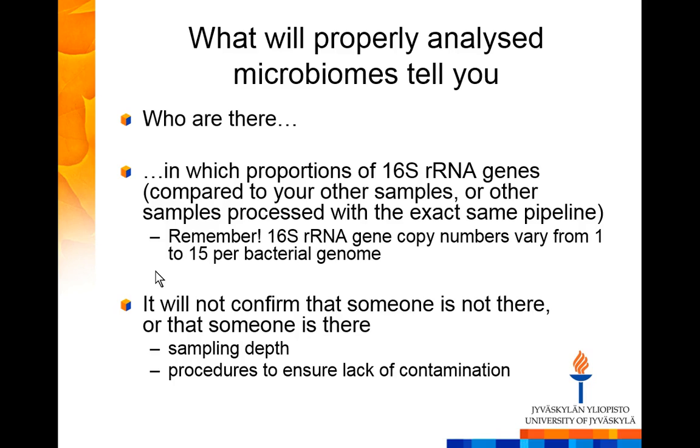If you sample it, well, you typically extract DNA from that 1 gram or half a gram. When you sequence your sample, if you have 200,000 sequences from one sample, that's very nice. That's already a lot. But obviously, those 200,000 sequences don't cover your entire 1 billion bacteria in that sample. So if you want to look for really truly rare taxa, then amplicon sequencing is not necessarily the method of your choice.